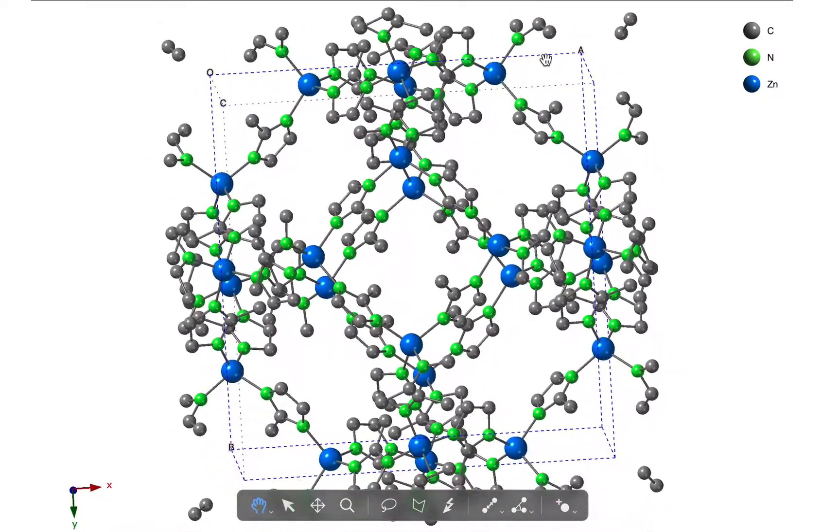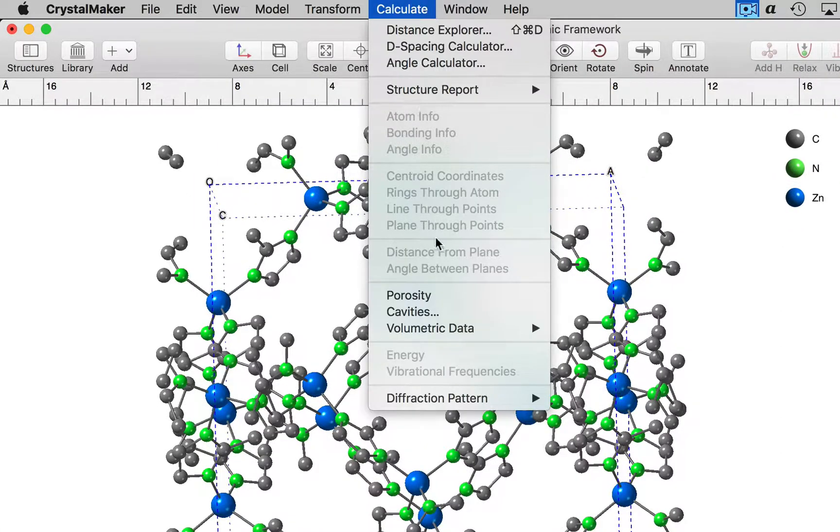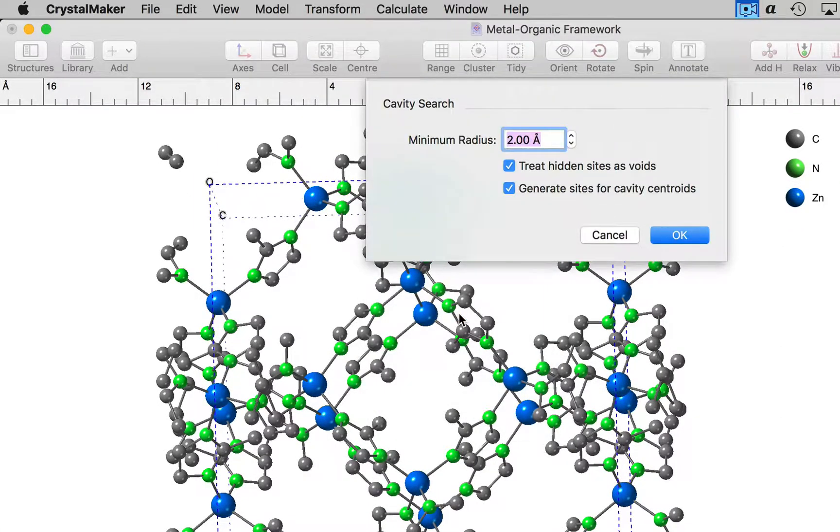We can determine the coordinates of that cavity using the calculate cavities command. We can specify the minimum radius of the cavity that we're interested in. Because this is a very open structure, I'm going to specify three angstroms as my minimum cavity site.